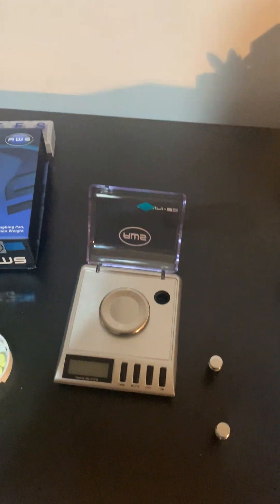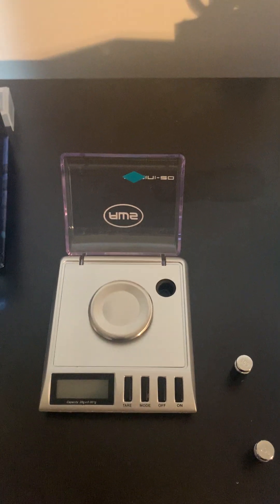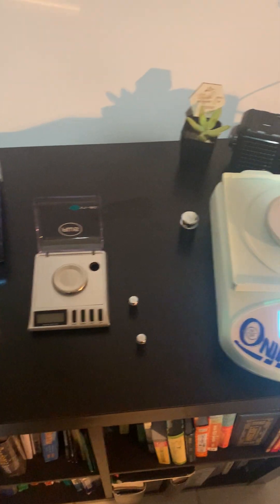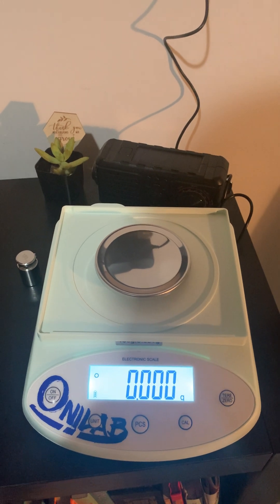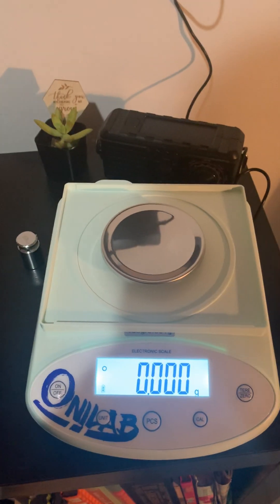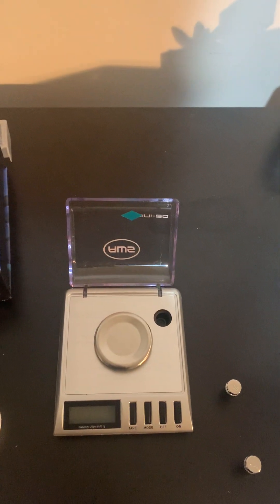Hey all, so today I'm going to do a comparison between the scale I've been using to measure my wife's taper from benzodiazepines, which is the Gemini 20 — known across many forums as a good, accurate scale — and compare it to one I just bought called the Onilab. This one was advertised as a lab-grade, industrial-strength, high-precision scale. At $100, I thought it would be a bit better than the Gemini 20.